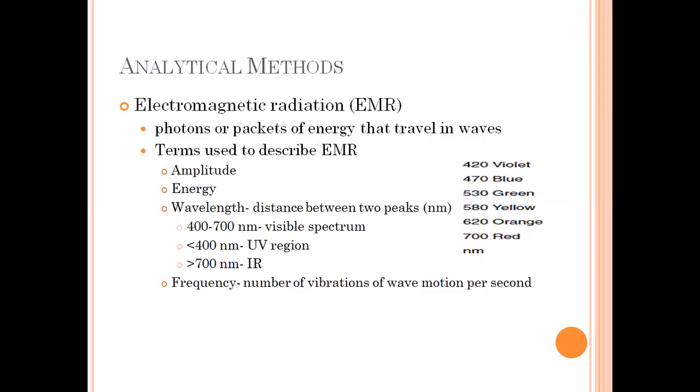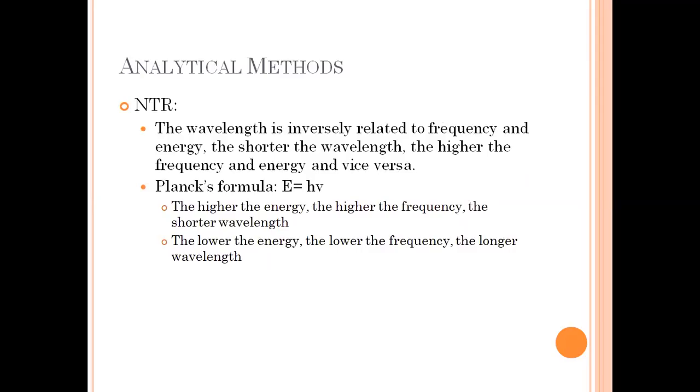So they have an inversely proportional relationship, the wavelength and the frequency. With that relationship, we could say that the wavelength is inversely related to frequency and, of course, energy. So the shorter the wavelength, the higher the frequency and energy, and vice versa, meaning the longer the wavelength, the lower the frequency and, of course, the energy.